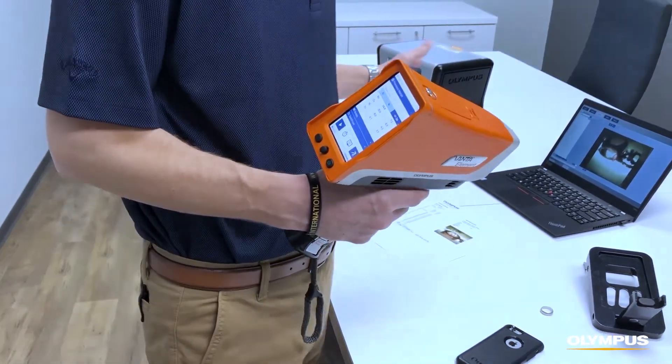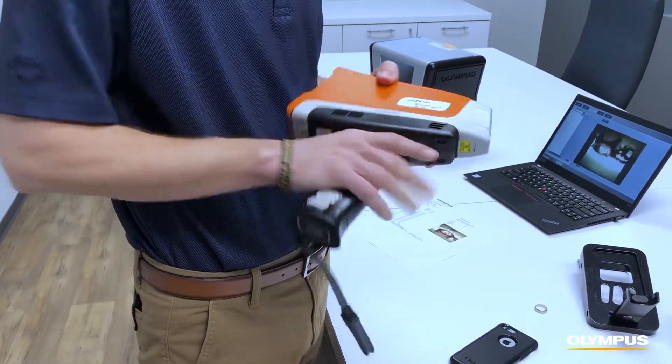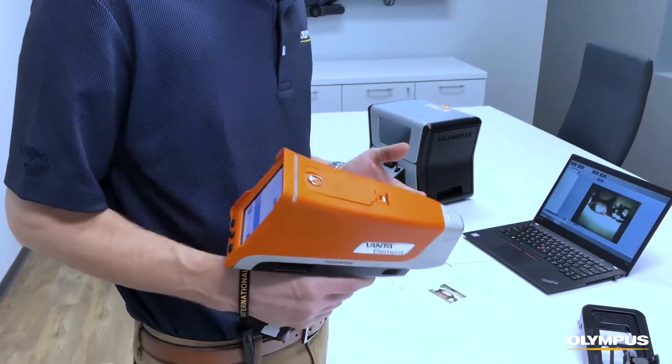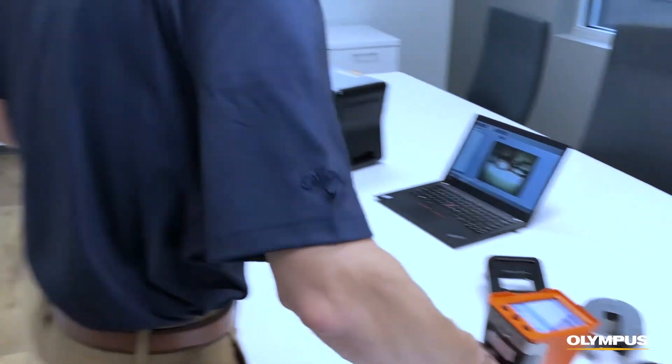In addition to the Gold Expert, another option is the Vanta Element. The Vanta Element provides many of the same features as the Gold Expert but has the added benefit of being a handheld form factor — you can bring the instrument to your sample instead of the sample to your instrument.